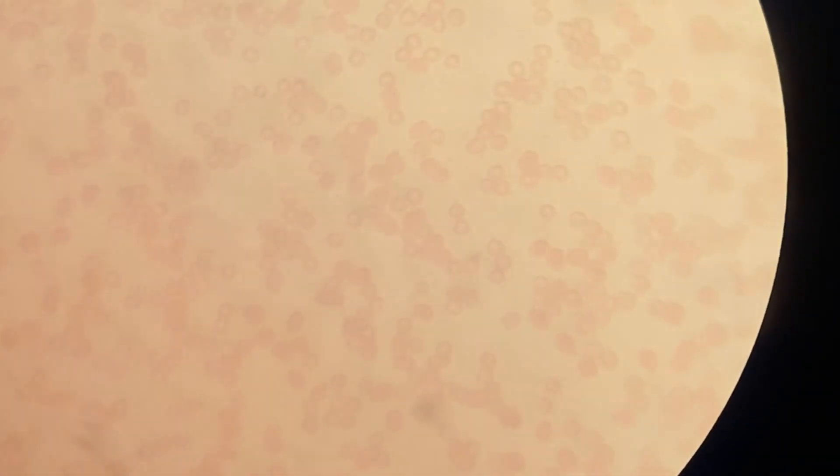One hour ago I drank my lemon water, and here is the result. As you can see, the blood is better than before. It was already good at the beginning of the test, but now my blood is almost perfect — all blood cells are separated. It is really good!